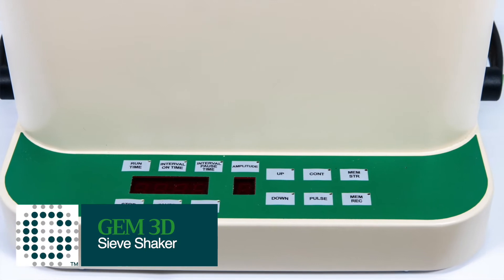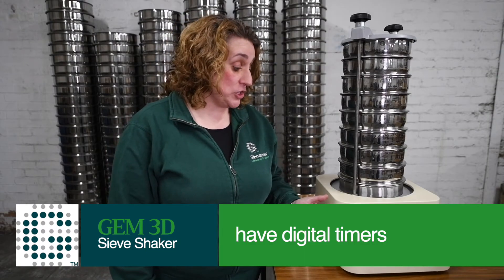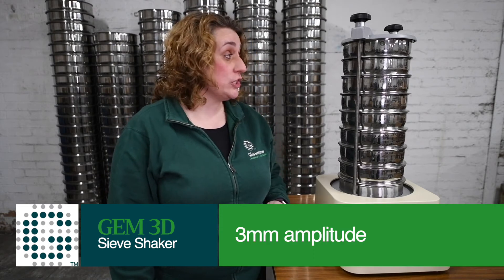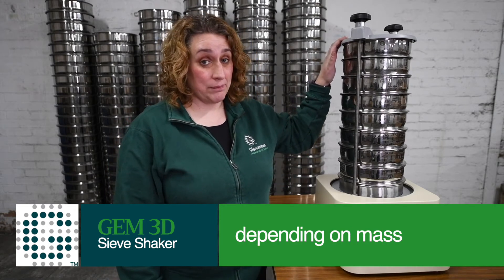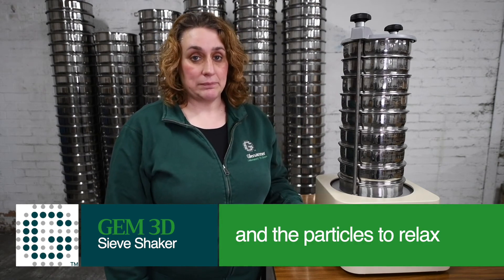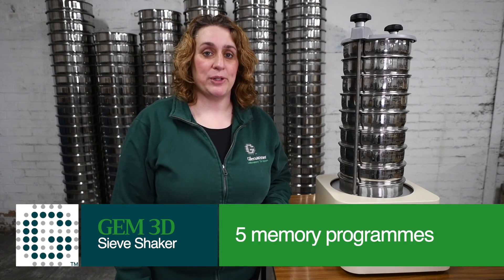The Gem 3D sieve shakers, both the advanced and the basic, have digital timers. They run from 0 to 99 minutes and 99 seconds. They both have a 3mm amplitude, dependent on mass. However, the advanced system has an interval timer. This allows the sieves and the particles to relax. It also holds up to 5 memory programs.